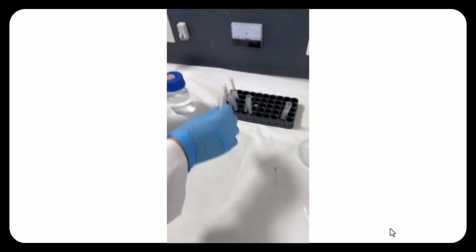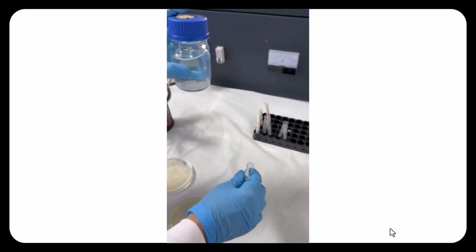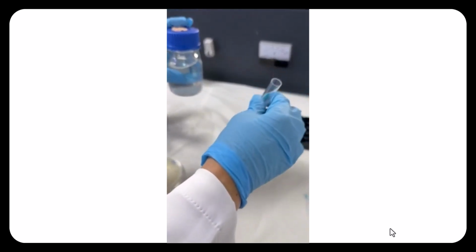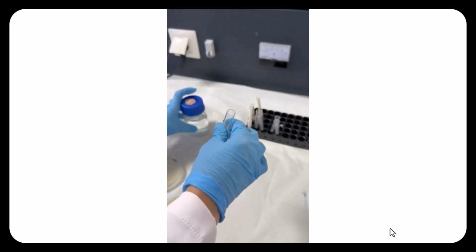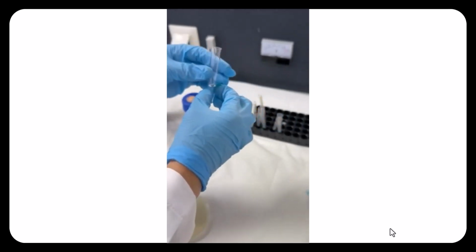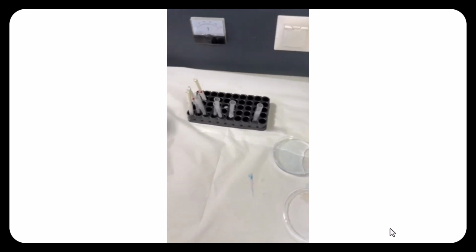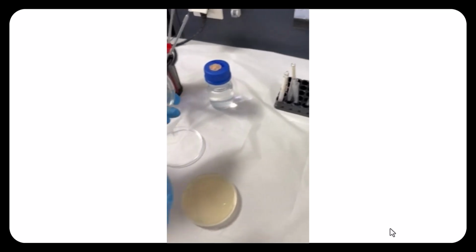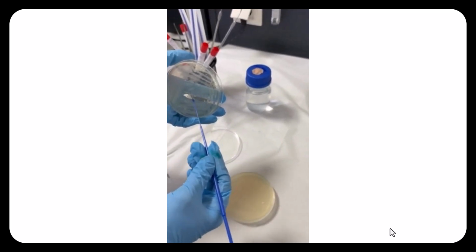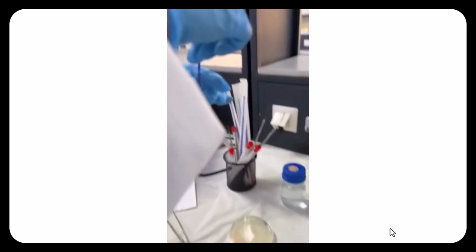First, we make the bacterial suspension. We need the McFarland standard 0.5, or measure the turbidity in the turbidimeter. If we don't have the turbidimeter, we make the suspension and compare with the McFarland standard. We put 2 to 3 ml of normal saline, and by sterile loop, we put 1 to 2 colonies of bacteria mixed with the normal saline, 2 to 3 ml of normal saline.